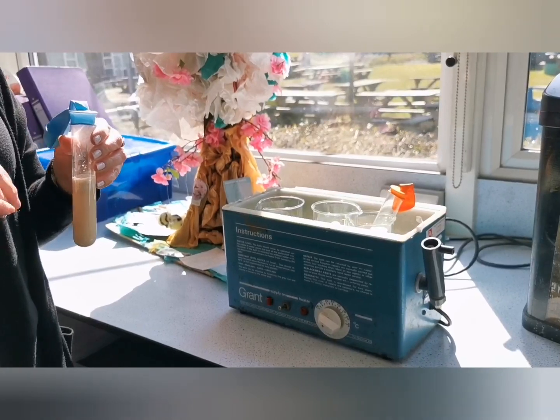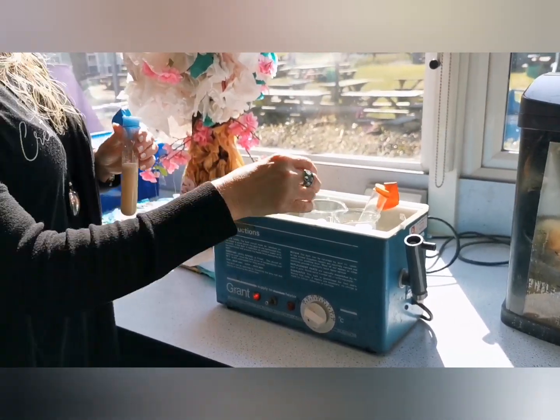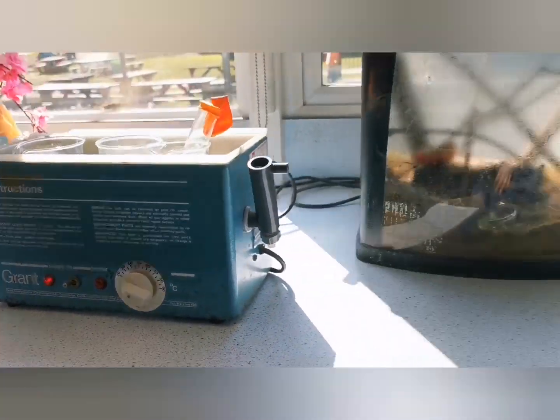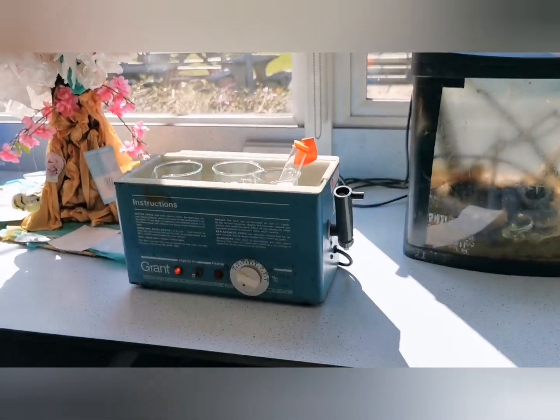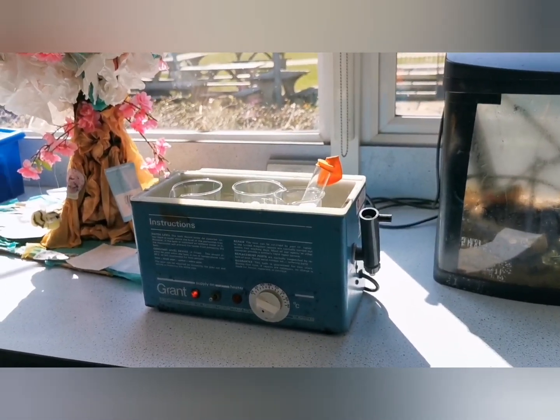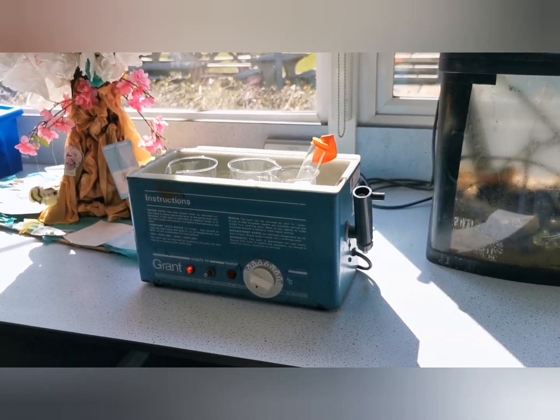So year 8, what I'd just like you to do is make a little prediction to yourselves. Just to recap, we're going to have test tube 1 in the fridge. We've got test tube 2 at 20 degrees. Test tube 3 is at 40 and test tube 4 at the back there is at 90 degrees. Which one do you think is going to produce the most carbon dioxide? Which one do you think the yeast is going to be the happiest? Check back with you in a minute.